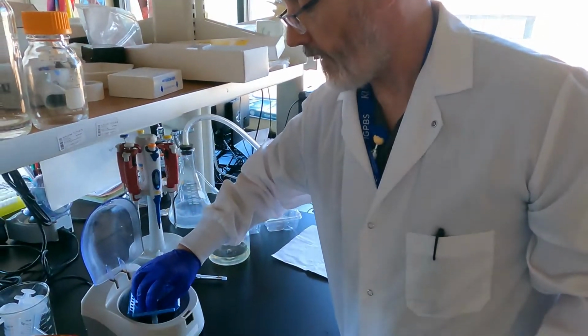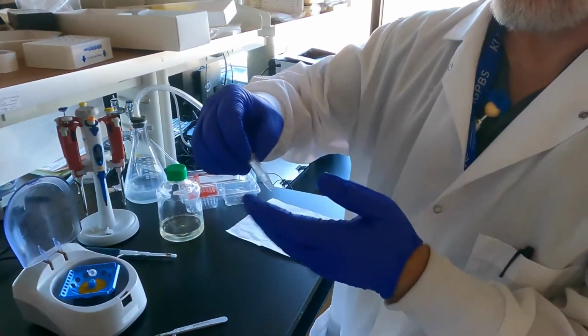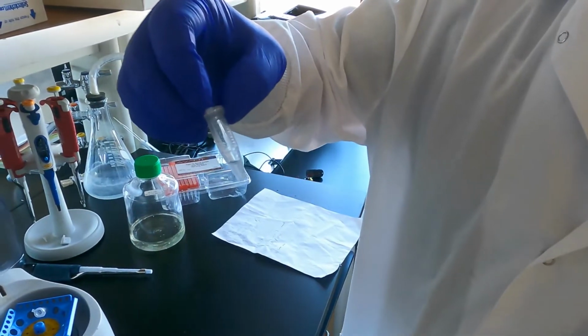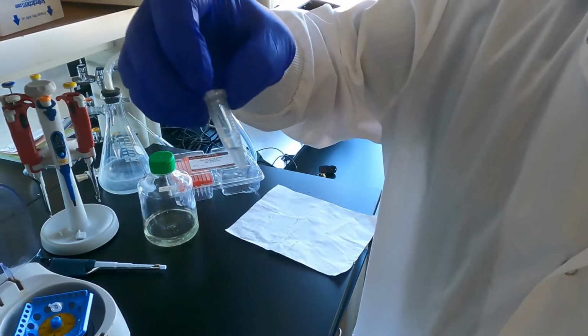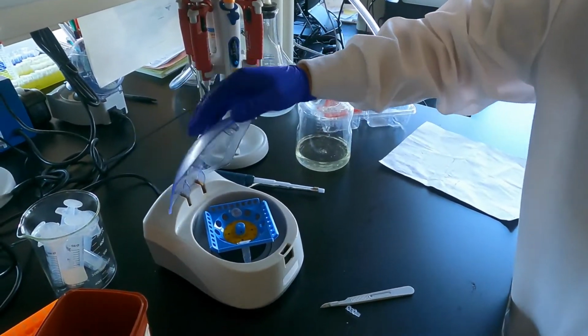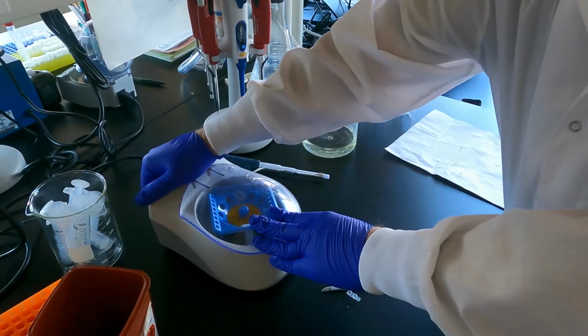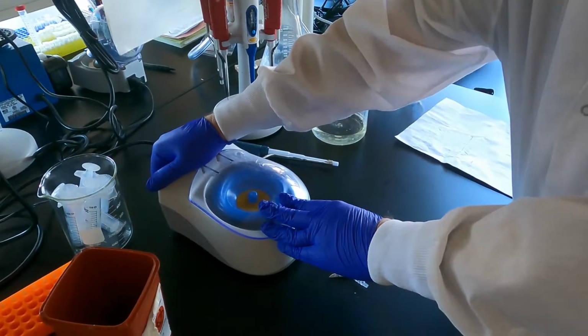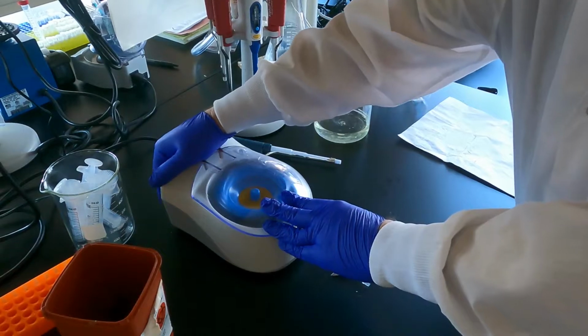There you go. What we want is 100 microliters of cells in buffer R. And so we've got 200 microliters of cells here at 2.5 million a mil. We spin them down and take them up in 100 of buffer R. We'll be all right. Just a quick one up and down.